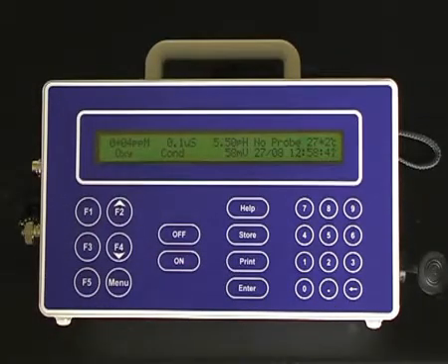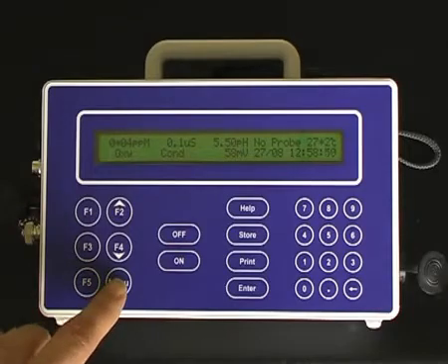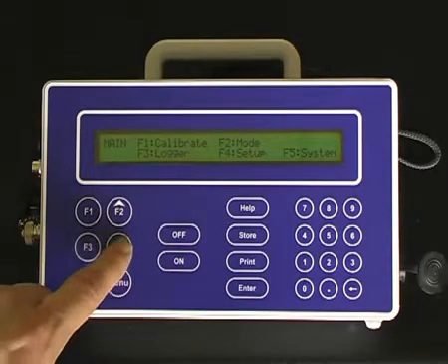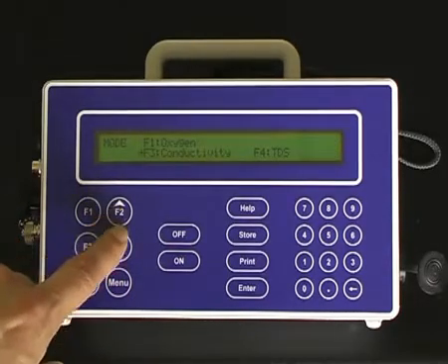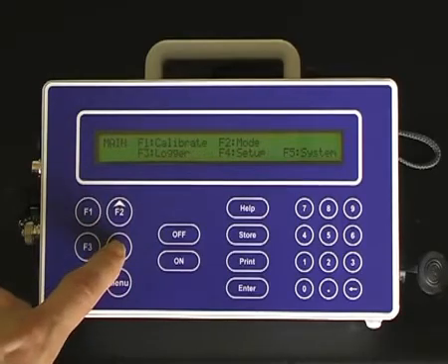To calibrate for TDS, the same sensor, the conductivity sensor, is used. However, the mode of the 90FLT has to be changed. Select Menu, F2 for mode, and F4 for TDS.